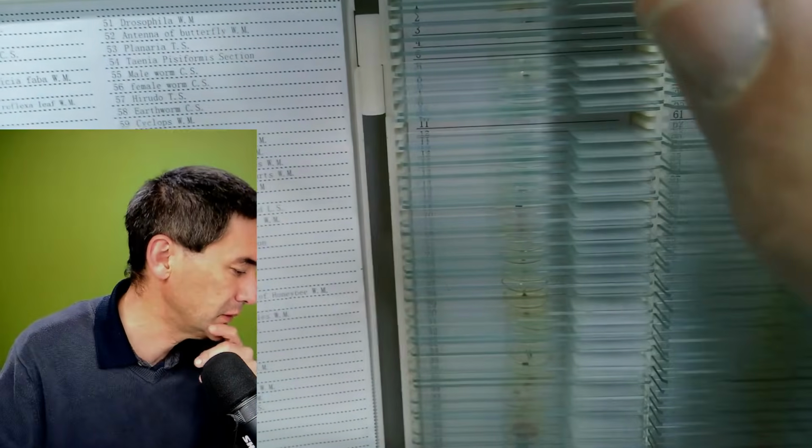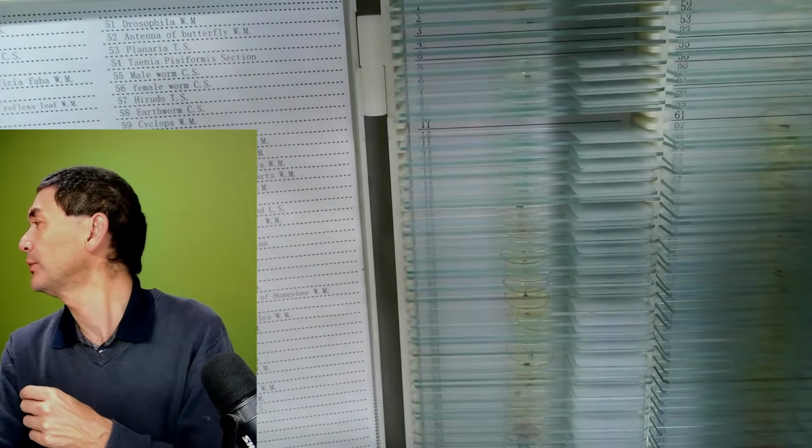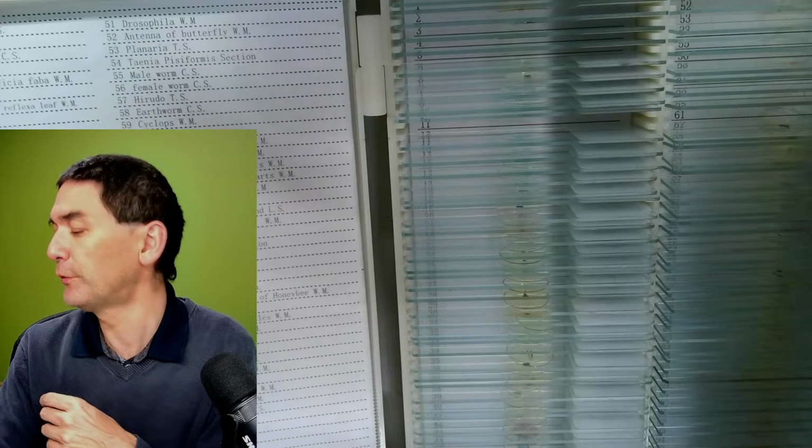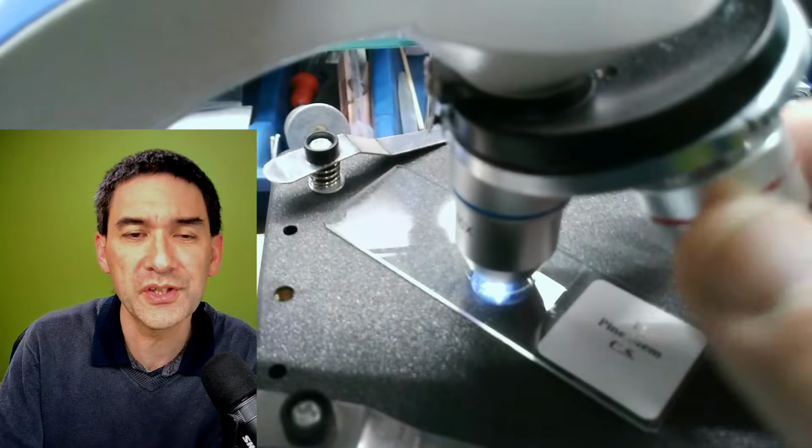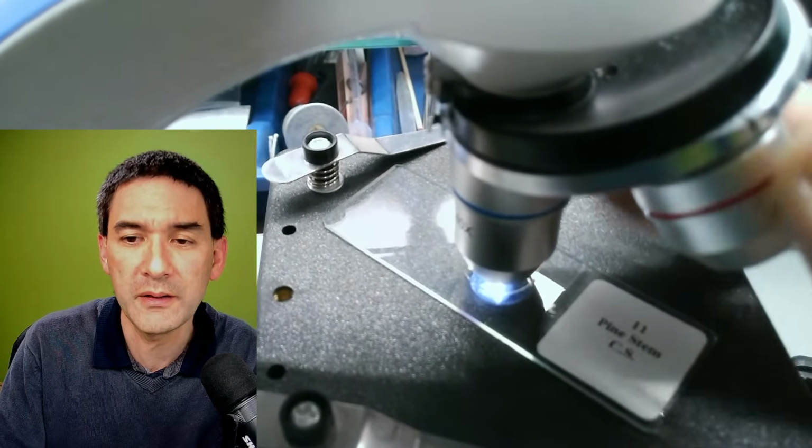Unfortunately, I don't have other optics here with me right now. But these are not standard optics, so it's also not possible to get replacements for those. It would probably not be really worth it, because the whole microscope is so cheap in any case.